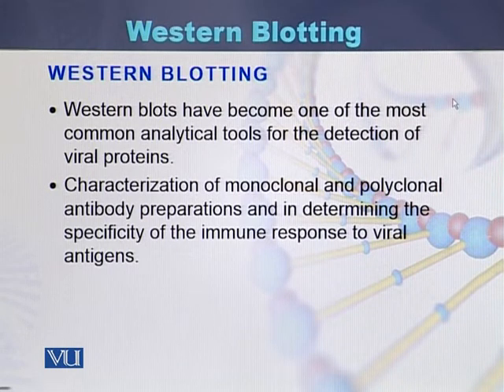Western blotting has become one of the most common analytical tools for detection of viral proteins, as well as it is important for characterization of monoclonal and polyclonal antibody preparations in determining the specificity of immune response to viral antigens.